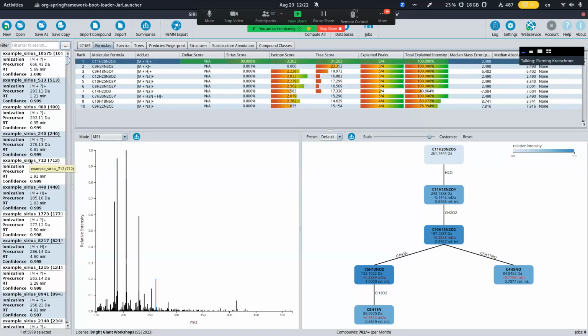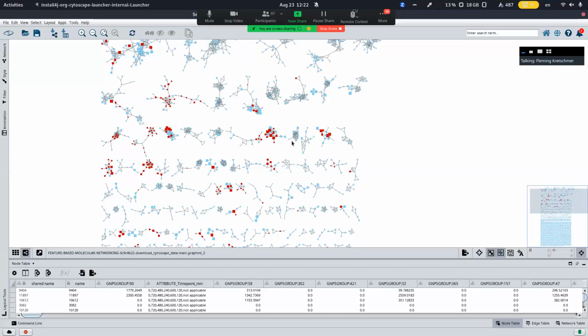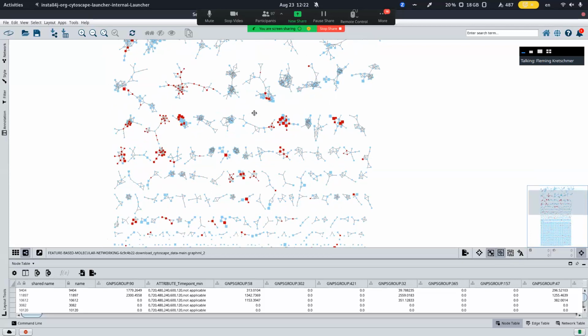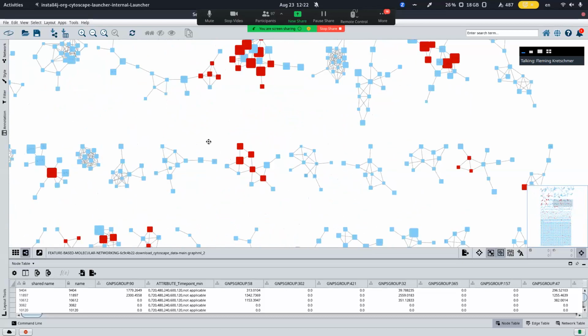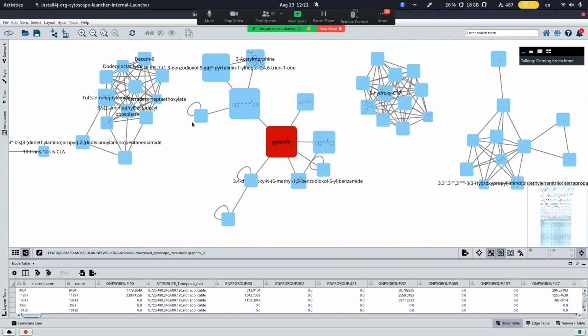But let's finally go into one example. And you don't have to follow along for this part. I'm just going to go into the molecular network and just grab some cluster where we, at least in this network, do not have a spectral database find. So let's, for example, look at this cluster here. You can see if you zoom in, or I can see at least, that we have already annotated our network with a few things, which you're going to learn in the next session today.